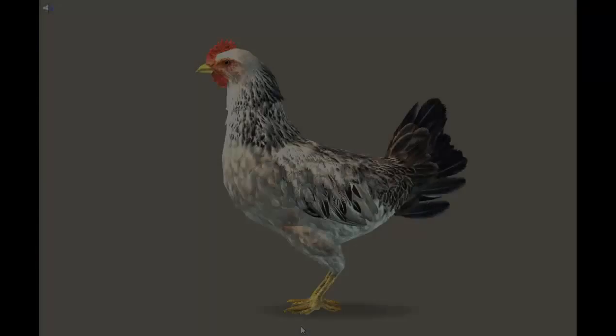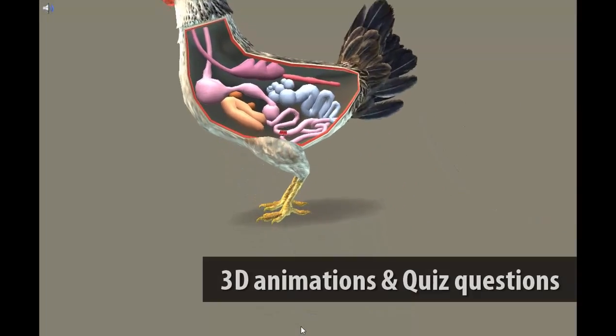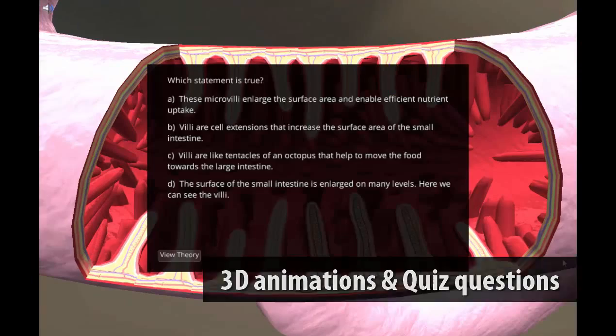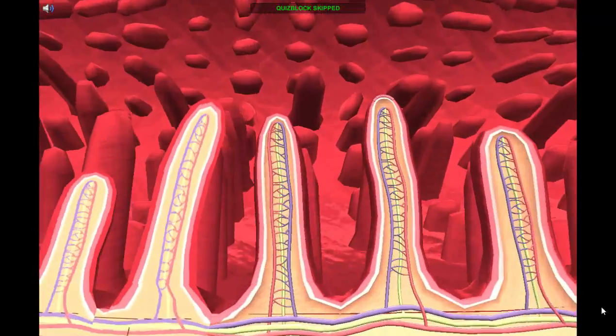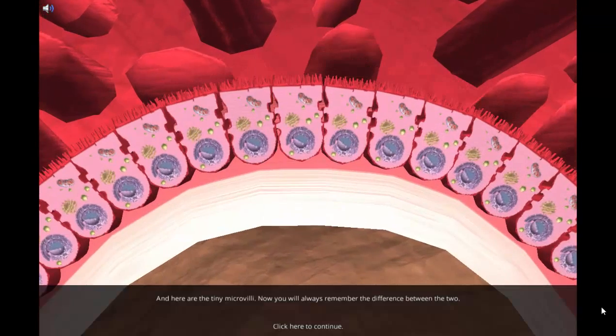Immersive 3D animations and quiz questions provide thorough content about the different microscopy techniques, celiac disease, and intestinal inflammation to ensure student understanding.